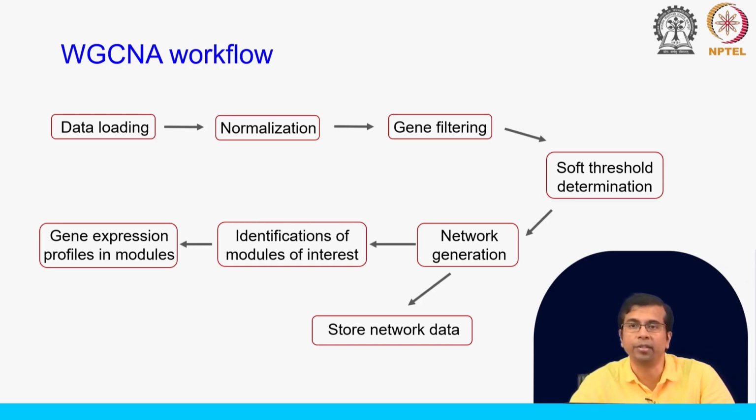Okay. So, that means the genes that are lowly expressed, they appear to be more variable. So, this is something we need to do with variance stabilization, and at this stage what we will do is, instead of taking these all 39,000 genes, we will actually do something called gene filtering, and we will choose only the top let us say 10% genes or 5% genes that show the most variation across samples. Right.